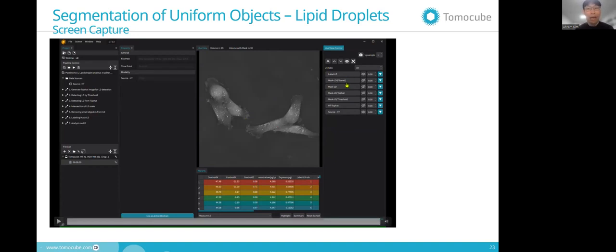And if you want, you can visit each layer or each output to see how the analysis went on during the process. And you can refine the results by visiting those outputs and controlling or adjusting the parameters for each relevant process. And also you saw that the results can be displayed in 3D, and also the targets like the LDs can be separately displayed in 3D to have a better idea about the analysis results. So this is how the analysis works in TomoAnalysis.